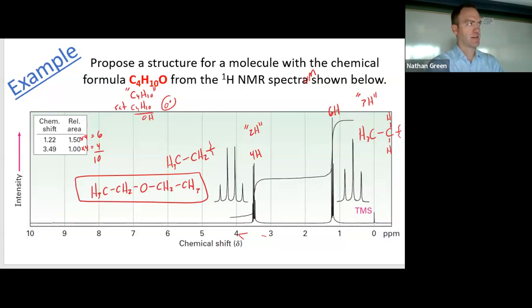That's probably not correct. Instead, what I want you to do is look at an NMR like puzzle pieces. Draw the puzzle piece. That's one. That's the other one. Then start putting the puzzle pieces together to draw the final thing.